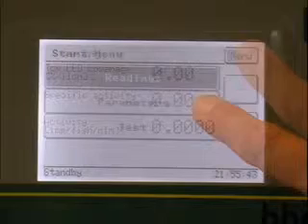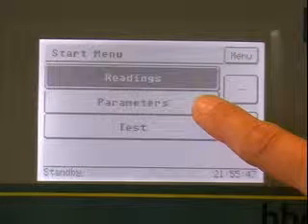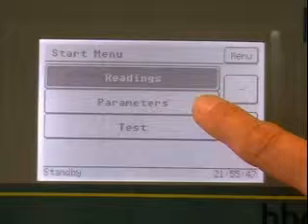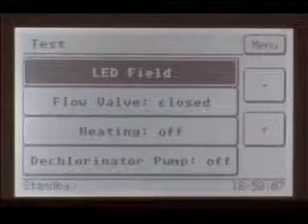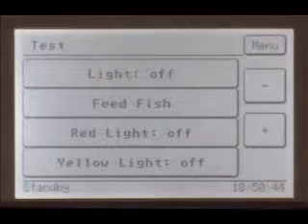There are three main menu points to choose from: Readings, Parameters and Test. The Readings menu contains the measured values and other detailed information. The Parameters menu shows the settings of the instrument and enables changes if necessary. In the Test menu, it is possible to carry out hardware checks to test the instrument's functionality.